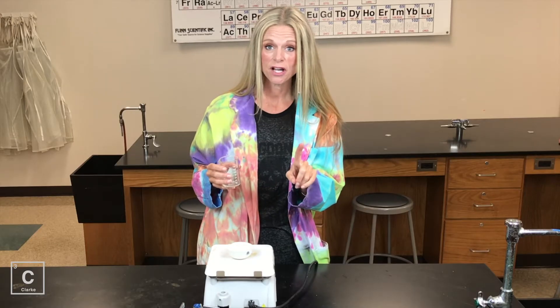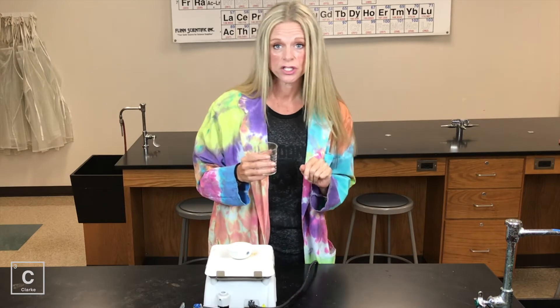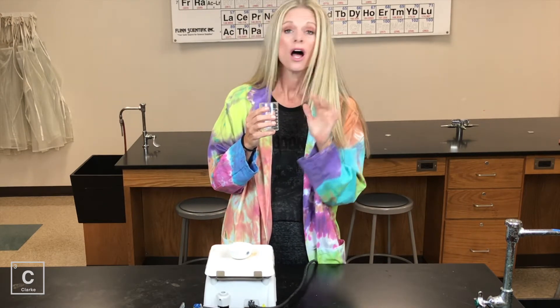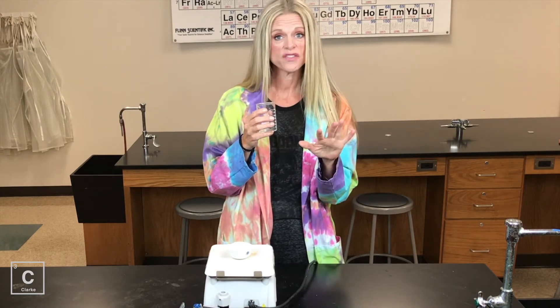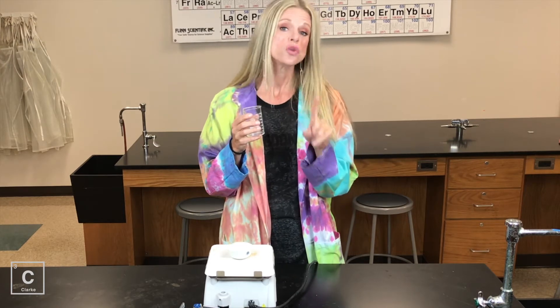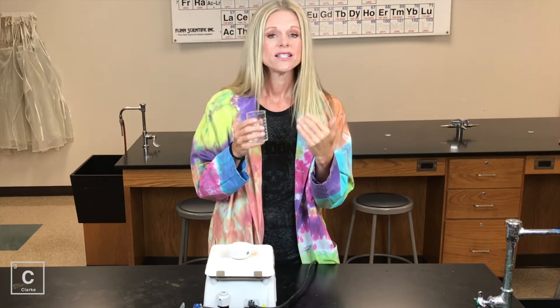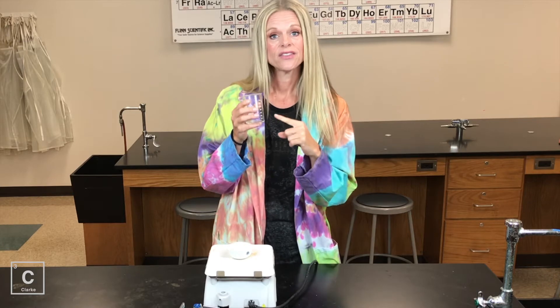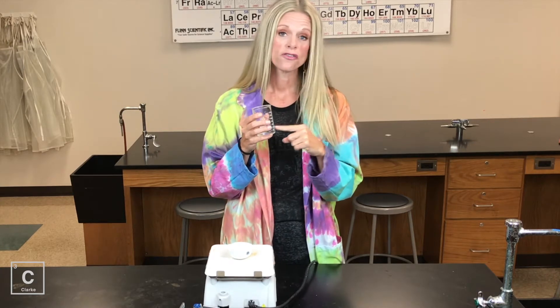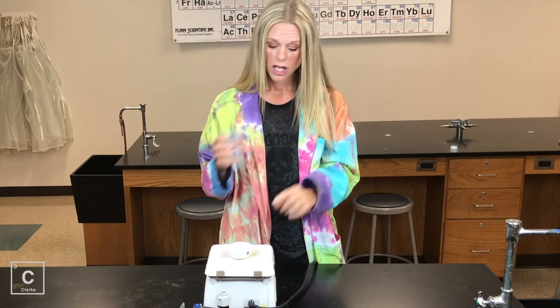Remember where we left off last? We had just filtered our mixture and we realized that there was still a combination of substances in our filtrate. So we want to take it a step further — we want to separate the tiny solid particles from the liquid particles, so we need to evaporate those off.